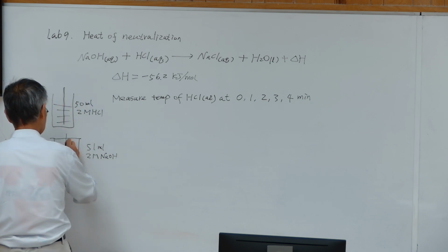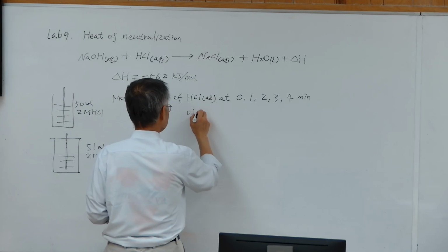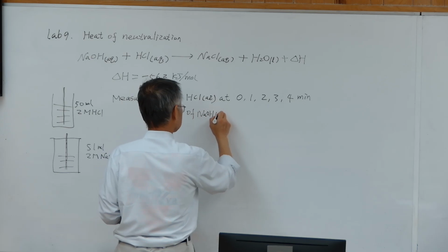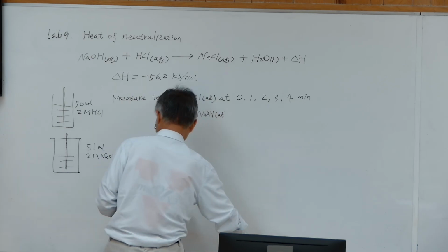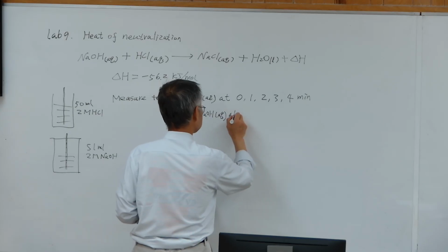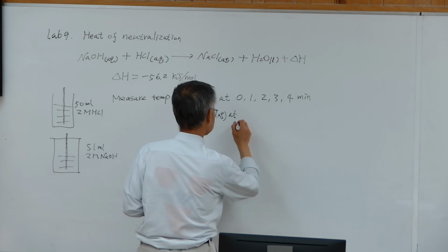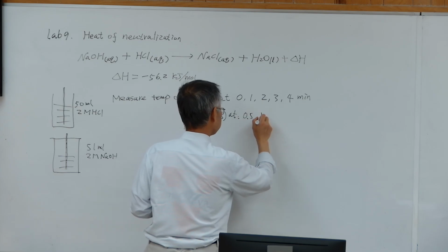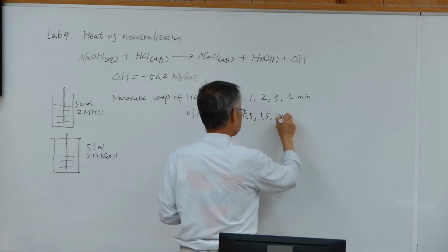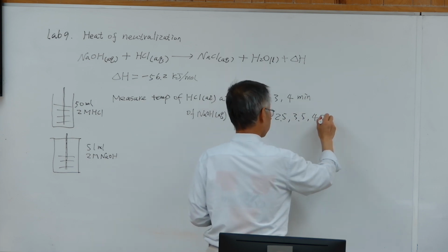Put a thermometer there and measure the temperature of this NaOH at 0.5, 1.5, 2.5, 3.5, and 4.5 minutes.